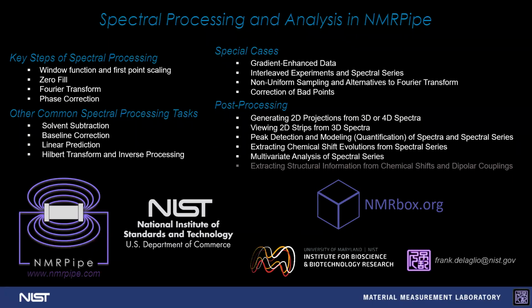Jinfa is also an incredibly skilled and gifted spectroscopist who measures the most beautiful spectra that I ever see. So he will have a point of view about NUS from the spectroscopist's point of view. And so I think that will be valuable to those of you who are doing a lot of experimental work and setup to hear what he has to say.